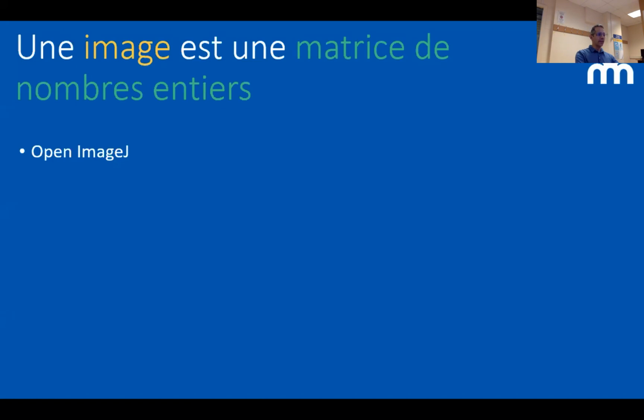So I really want you to have a hands-on experience and do things simply. In the chat, there is a link to download ImageJ. We're going to use it quite a lot today. So please download ImageJ and install it onto your machine, whether it's a Mac version or Linux version or a Windows version. The link is at the top of the chat.